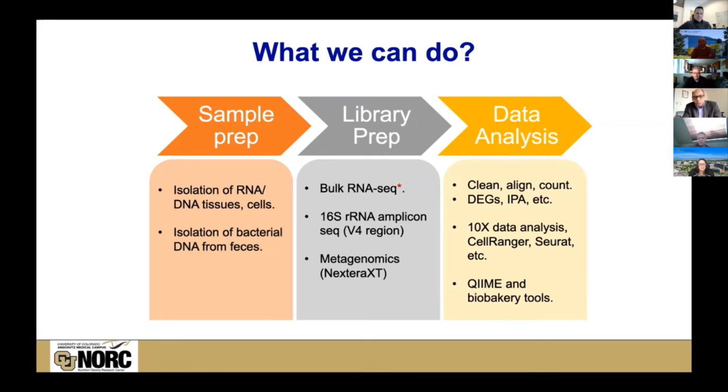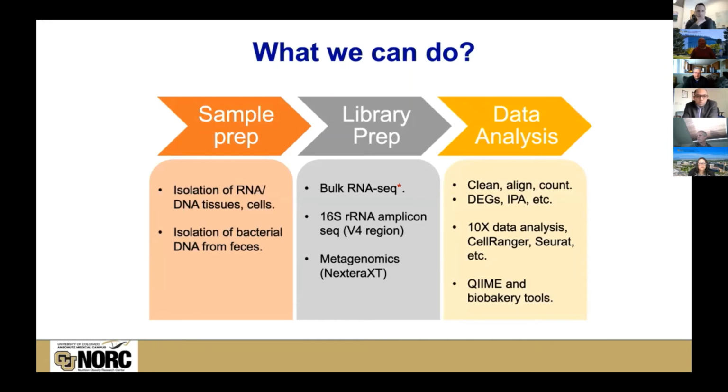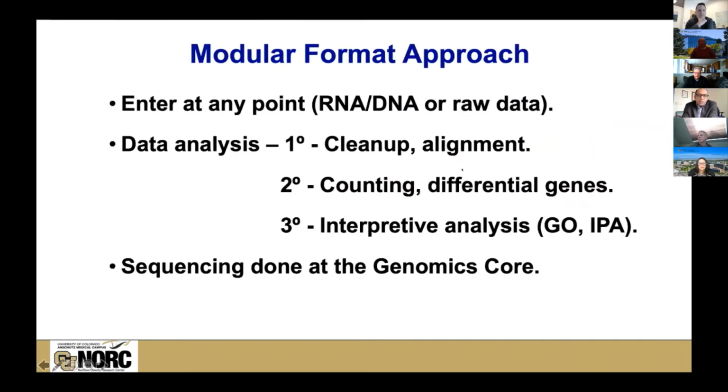We do have the workflows to support single cell RNA sequencing data analysis that are post data generation. And so we have users enter the 10x Genomics data analysis pipeline after they've generated data with the core. So the workflow is modular so that you can essentially arrive to the core at any point. You can either arrive with the sample itself, or you can come with data that has already been generated from the genomics core or even within a lab.